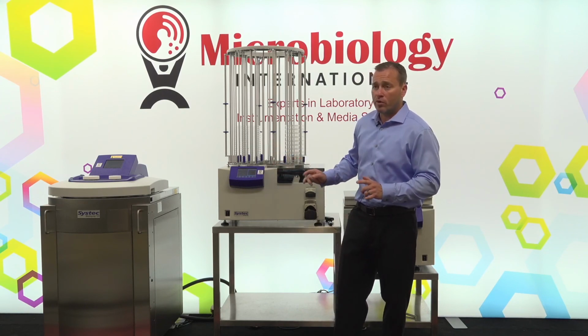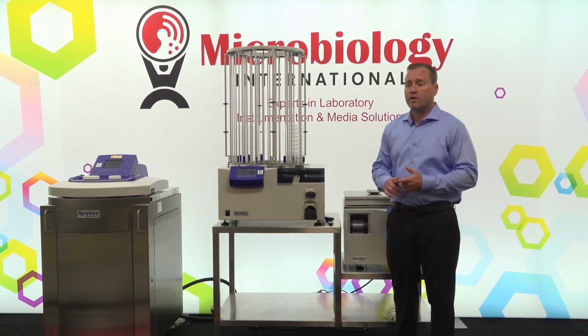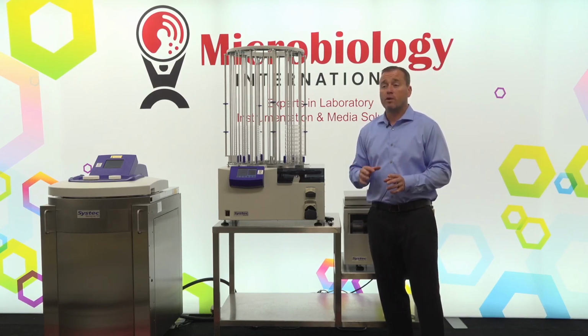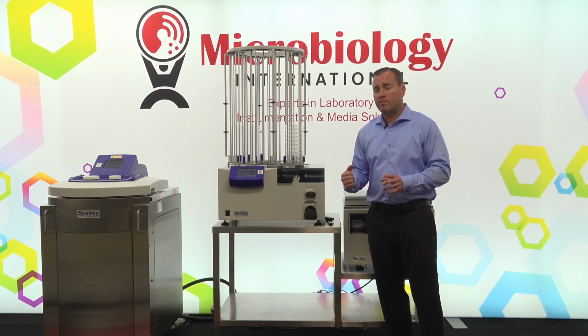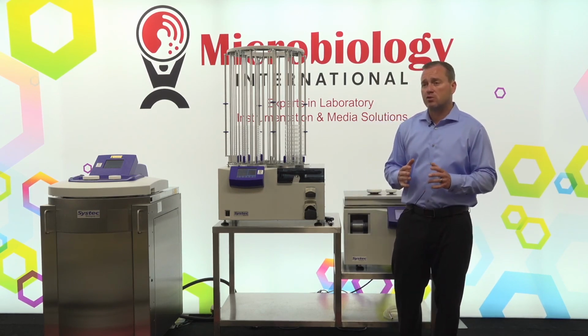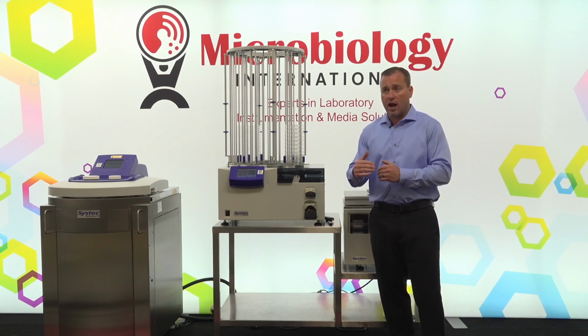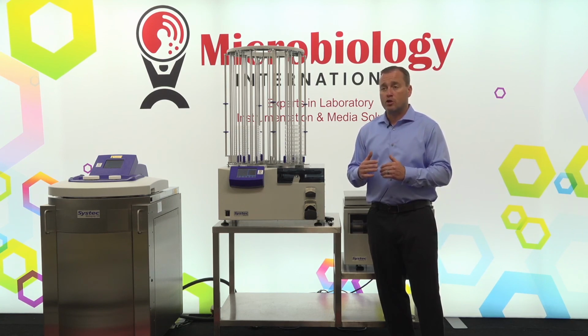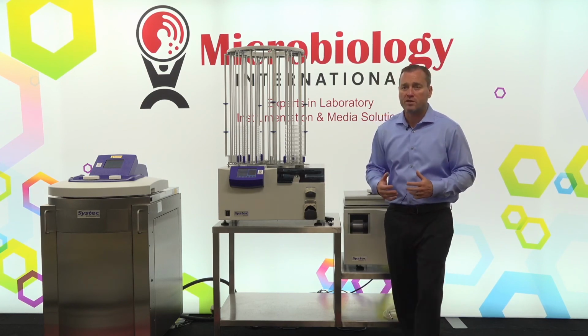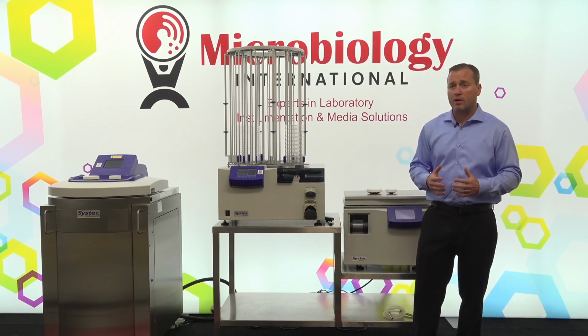So we only have them on the MediaPreps, and those are from 1 to 5, 1 being a very basic level that would allow you to get into the instrument and run programs, but it wouldn't allow you to alter any programs. Then up to 5 would be our service level. 4 would be the admin level that allows access to almost all of the parameters that are not service related. And then between 2 and 3, they just limit a few of the other options that you have available, but you would be able to operate the system. So 5 levels, 5 being service, so in essence 4 different levels for the users to be able to access.